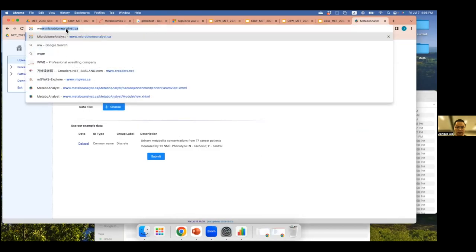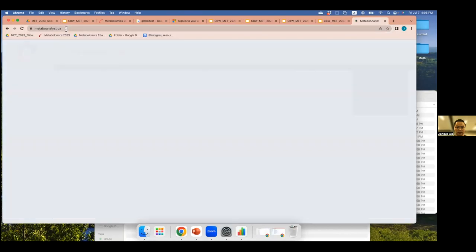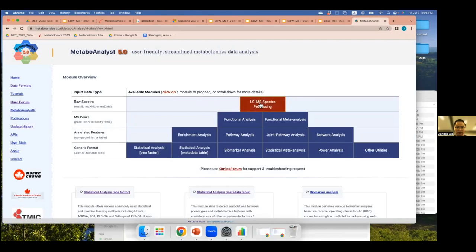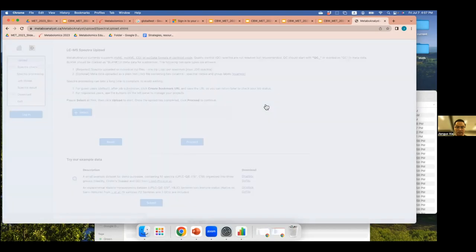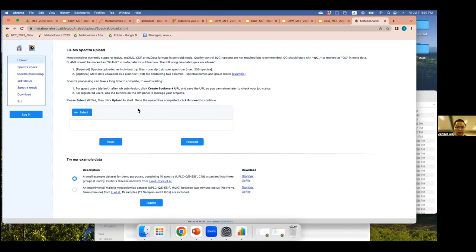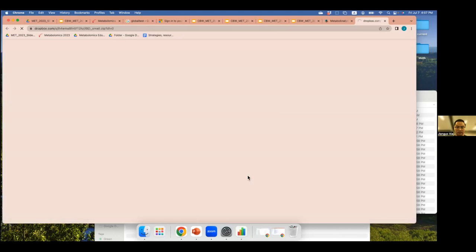Let's go back to the website. For LC-MS spectral processing, we're going to use the top module: LC-MS spectral processing. We accept all open-source raw spectral data formats including MZML, MZXML, CDF, and MZData. Users need to zip the files first and create metadata for the raw spectral files, then upload them together. Here in this demo I'm going to show you with the built-in example — a simple dataset with around 10 samples.